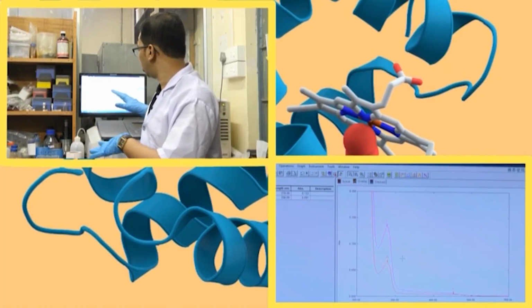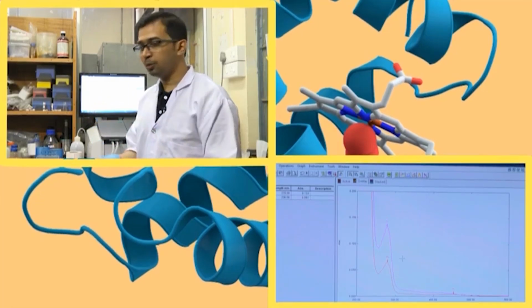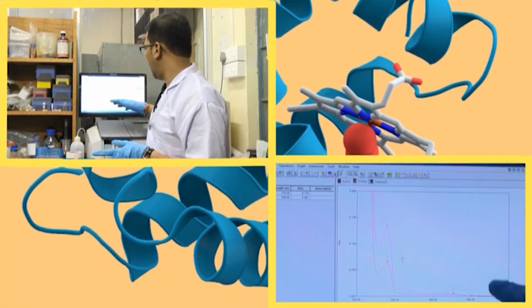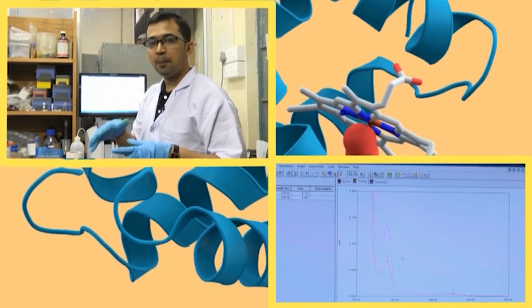Another error which I am letting you know comes during the experiment. No need to worry, these are all manual errors which we face regularly. Another error is that while scanning from 600 to 200, I have kept the scan speed as medium.